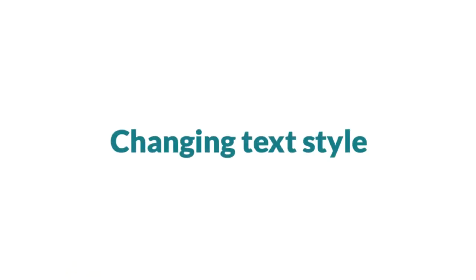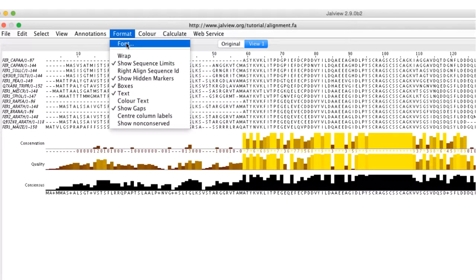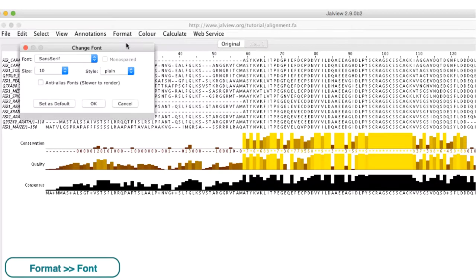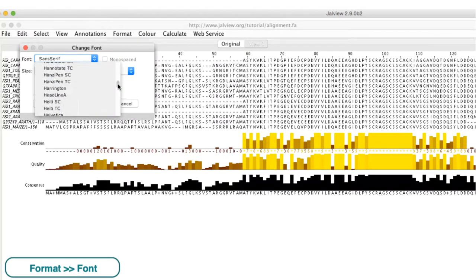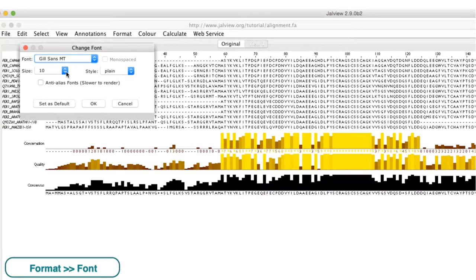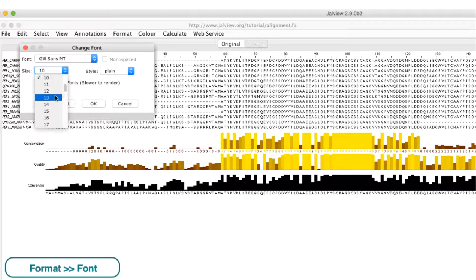Text font can be modified from the format menu by selecting font. The font type, its size, and style can all be customized.